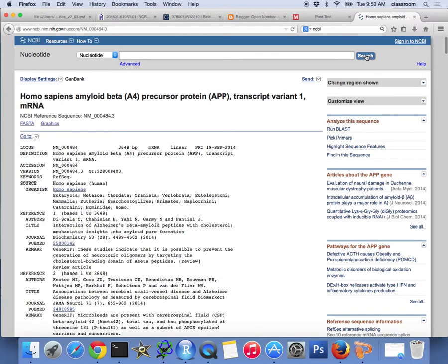It actually goes directly to this one. So double check here. NCBI reference sequence NM_000484.3. This is the gene we are looking at.